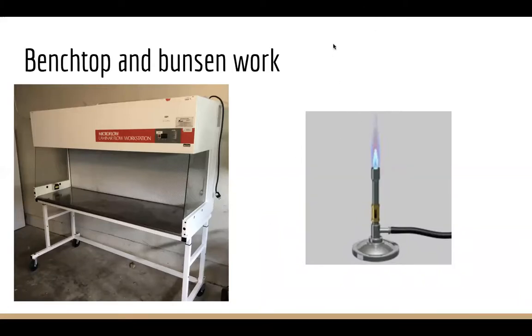So there's like an umbrella almost around maybe a 30 centimeter area. You've got to stick quite close to the Bunsen burner to make sure that you don't have any microbes accidentally falling onto your plates when you do this. But that's quite good. It's quite cheap as well.